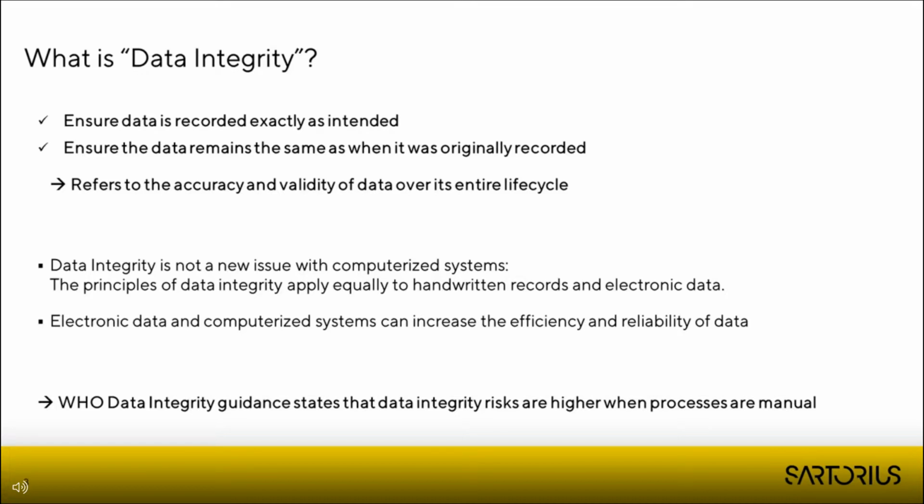But when you use a computerized system and you have this kind of seamless transfer from an instrument to this computerized system, you will see in this presentation that it's much easier to fulfill all the data integrity requirements and follow the principles than when you work completely manually.